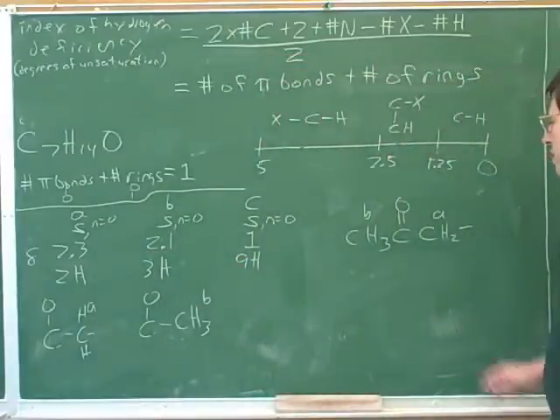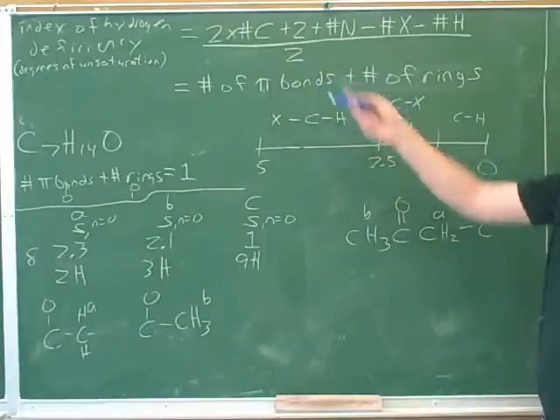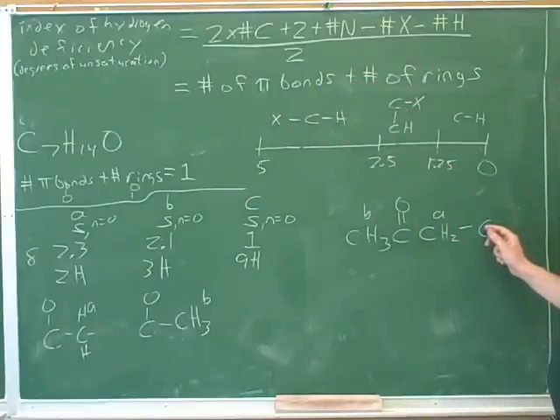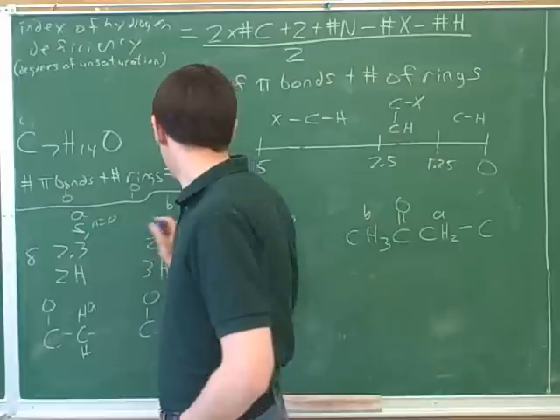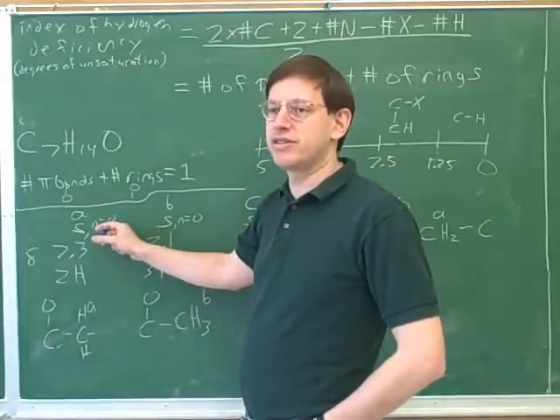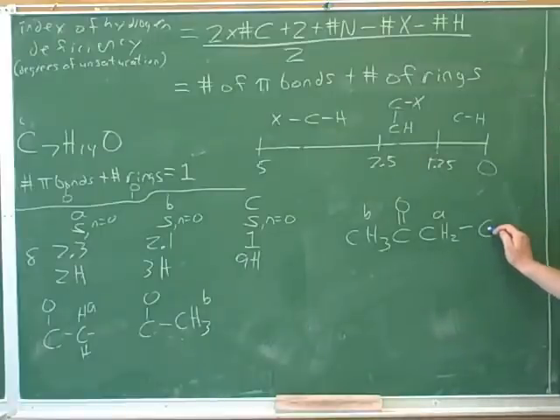So that's explaining why our group B gave us a singlet. And for that matter, we know that this over here must be another carbon, because that's all that's left. Well, how many hydrogens can there be on this carbon? There can't be any hydrogens because group A is also supposed to be a singlet. We know that N is 0 for all of these groups. None of these hydrogens can be adjacent to any other hydrogens. So there can be no hydrogens here.